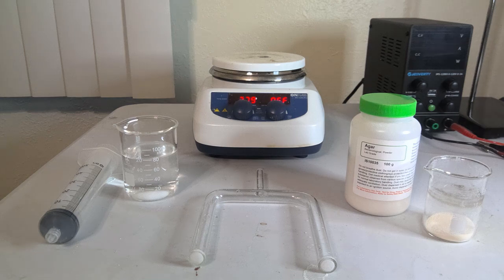How's it going everyone? I'm Jacob and this is Archimedes Taleb, and today I'm going to be showing you how to prepare an agar salt bridge to use for electrochemical cells for electrolysis projects.